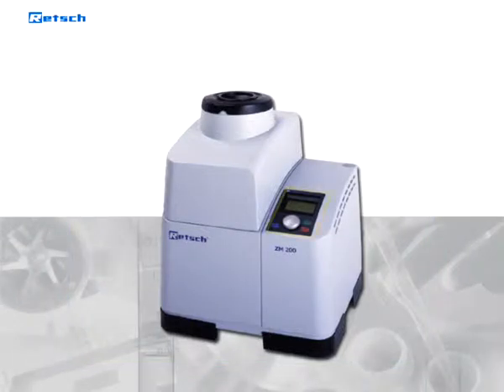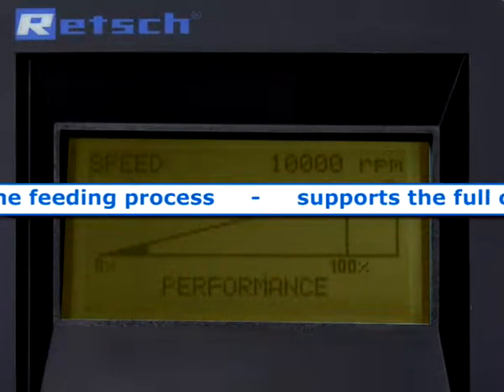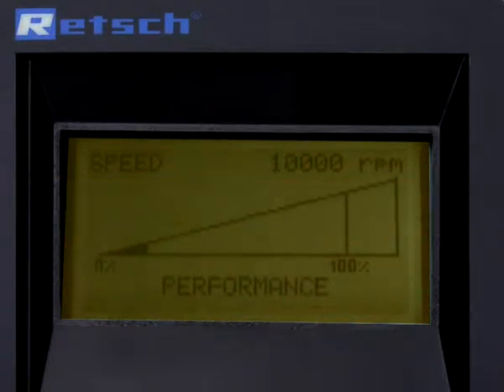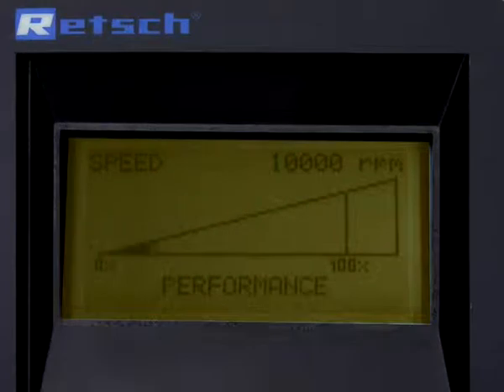The display, which always indicates the current performance status, assists the user during the feeding process and supports the full capabilities of the machine. The ZM200 is not simply cut out if slightly overloaded. Contrary to traditional centrifugal rotor mills, its power drive has the necessary torque reserves to avoid blocking of the rotor and ensure a regular test run.